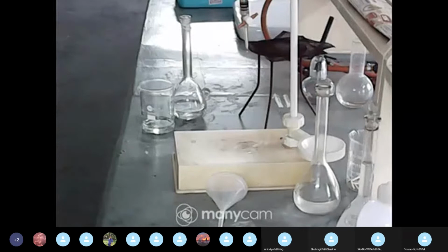If you want to write 24.7, then your 3 readings will be 24.7, 24.8, 24.7. Or if it is 25.1, then 25, again 25.1. In that way we can complete the observation part.